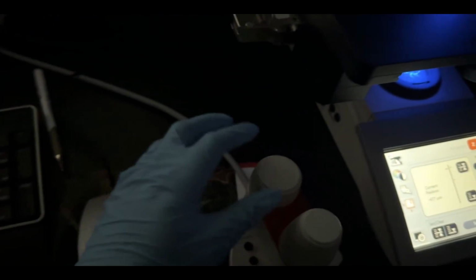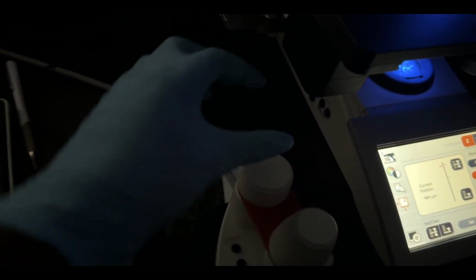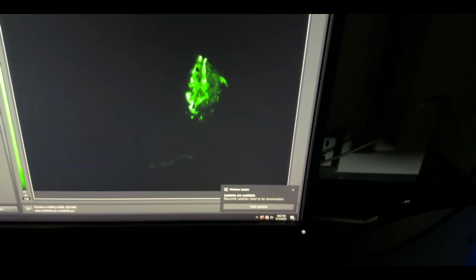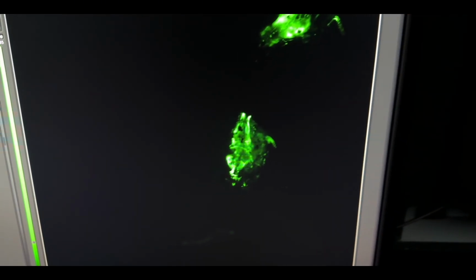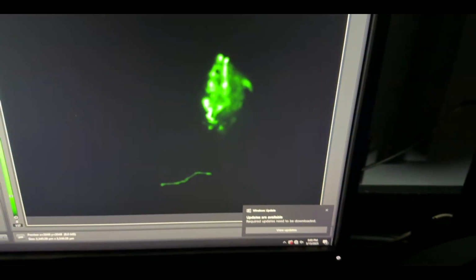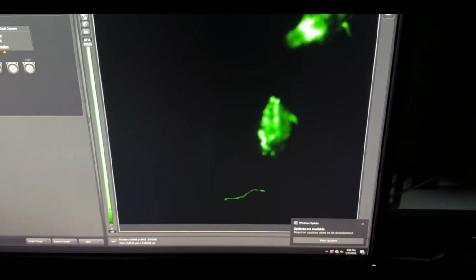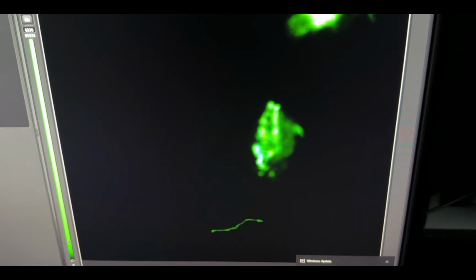The first thing I'm going to do is take this knob and turn it counterclockwise this way until I stop seeing what I'm interested in. So let's say we're looking at this sample, for example, and this isn't the greatest option. So I'm just gonna show you guys using blurriness as a metric. I'm gonna keep turning it counterclockwise until the sample gets blurry. So let me do that again so you guys can see as I was twisting it. Let's get it into focus.